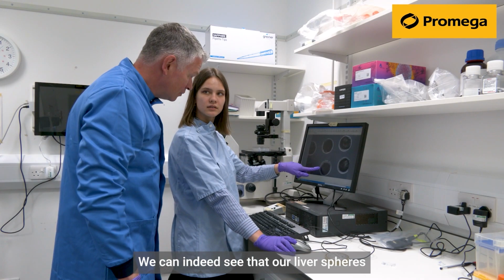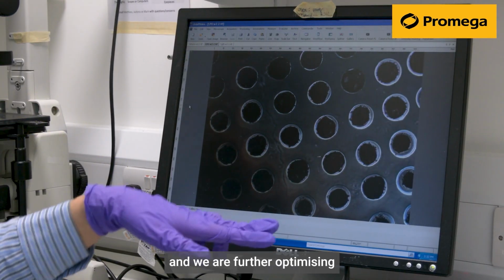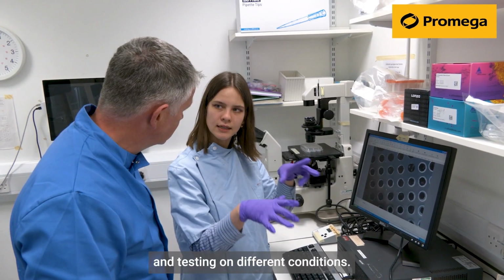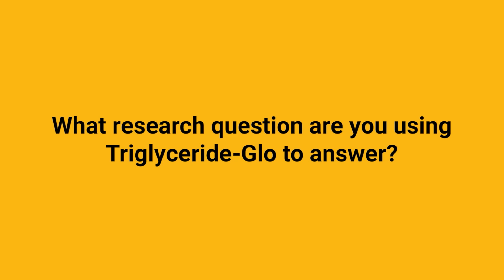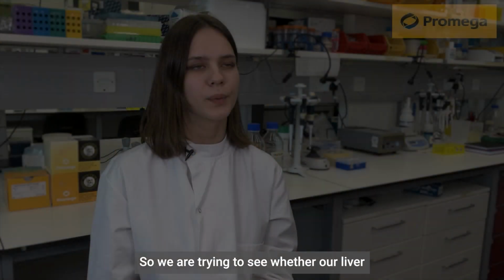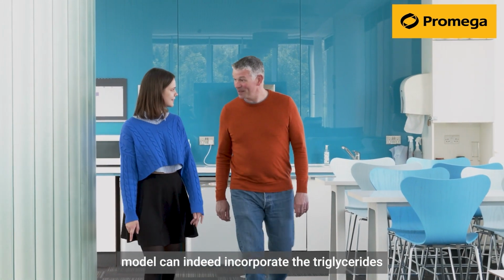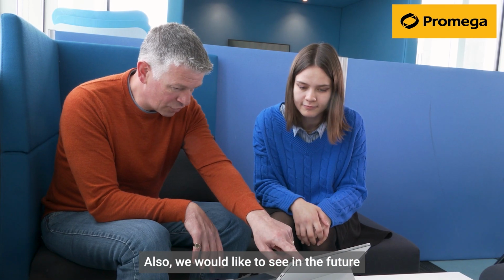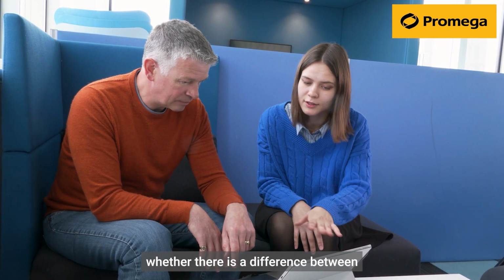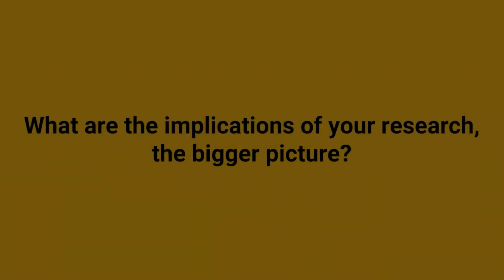We can indeed see that our liver spheres are accumulating the triglycerides, and we are further optimizing and testing on different conditions. So we're trying to see whether our liver model can indeed incorporate the triglycerides and whether it accumulates them. And also we would like to see in the future whether there is a difference between the steatoses and our control samples.